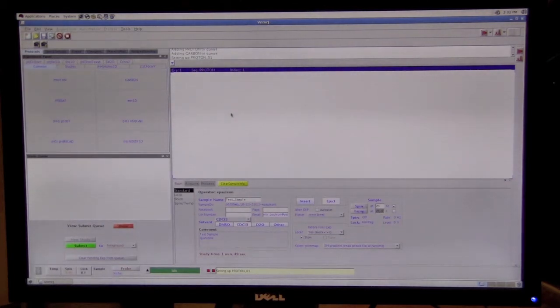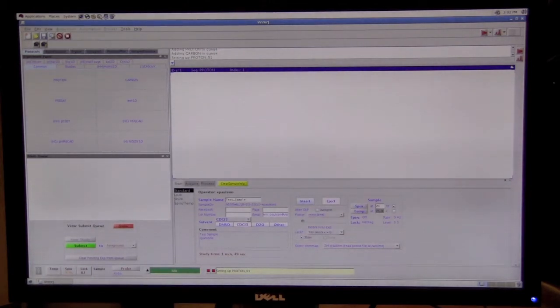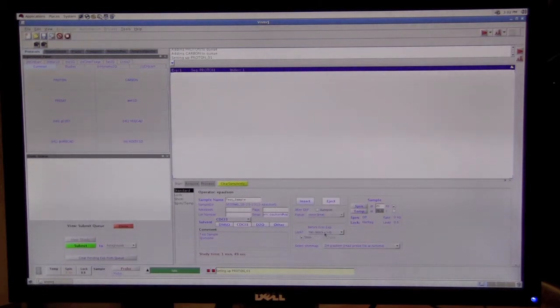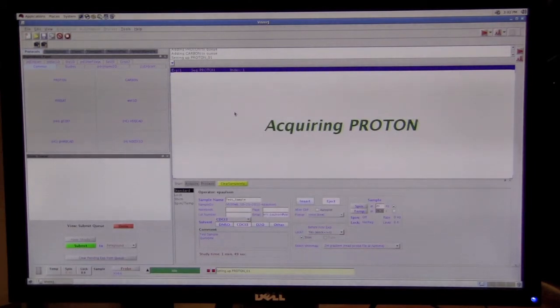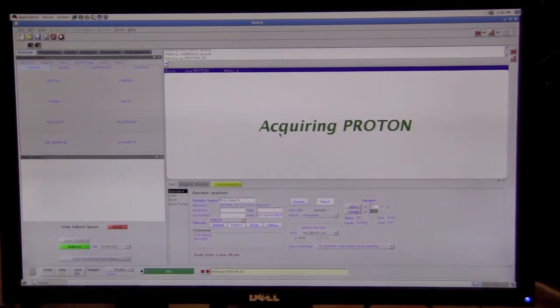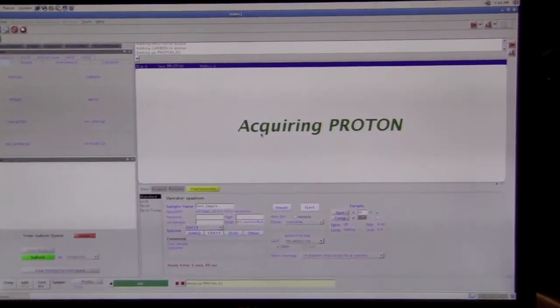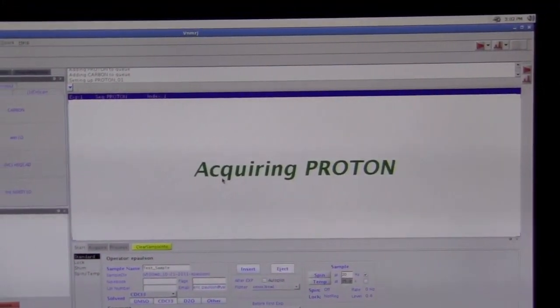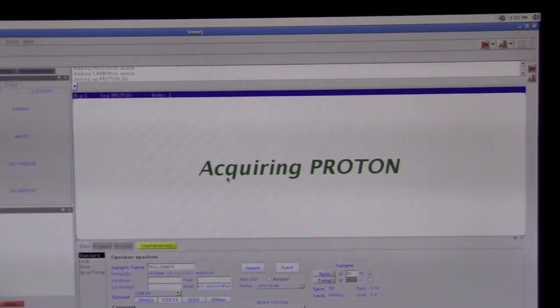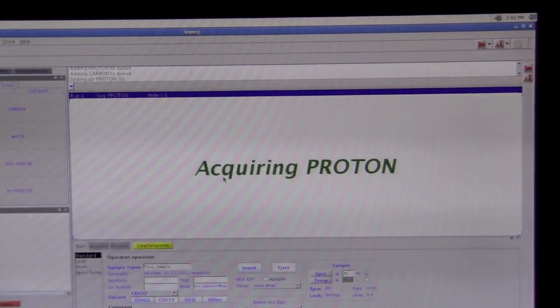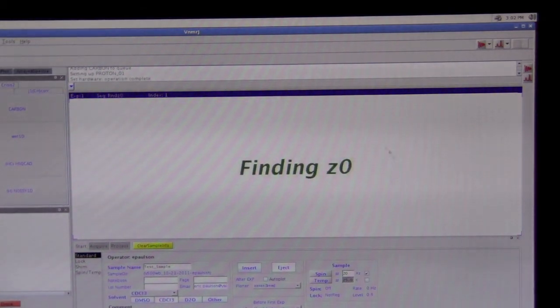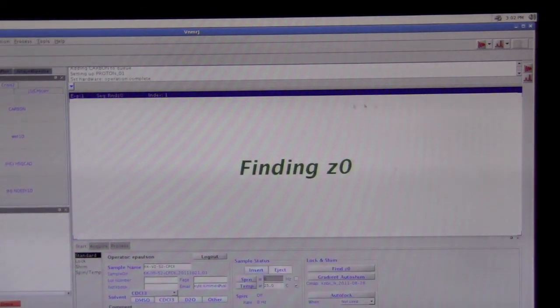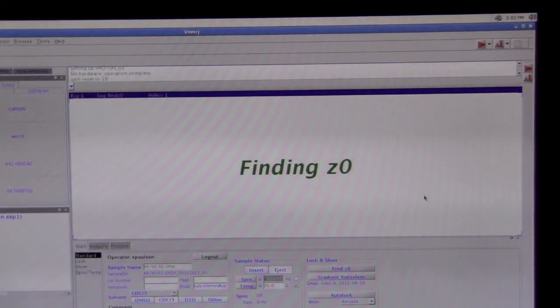It says it's setting up a proton. And now it is going to do automatic lock because we chose that option. When it does automatic lock, it doesn't call it automatic lock. Instead, it will say finding Z0. So, when it's doing finding Z0, that's doing the automatic lock, which will happen in just a second. There it goes. So now it is doing automatic lock.